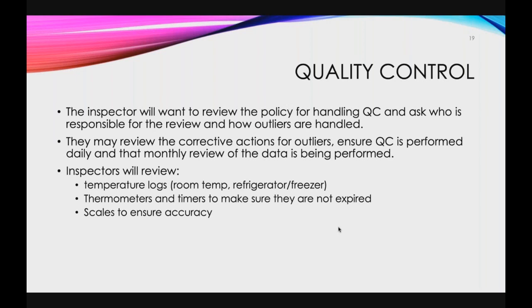With the thermometers and timers, the timers are a big thing, mainly not so much in histology if you're not running anything manually. They're mainly for FNA adequacy assessments, sometimes the frozen section room, the staining. If anything you say that you use a timer for, you have to make sure those have a calibration sticker and that they are not expired, because those are things we tend to forget. But it is something that is required and they do expire. So always make sure that you check those.